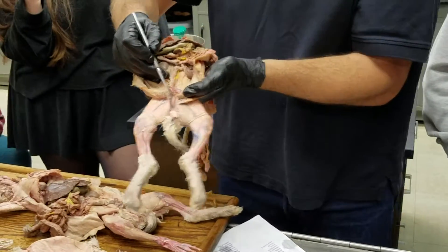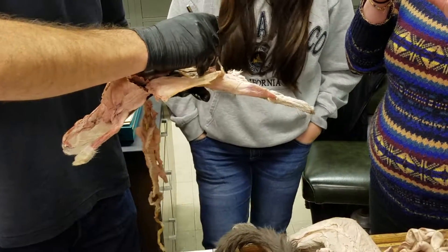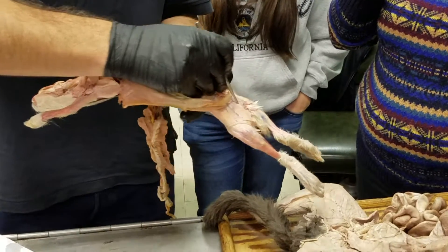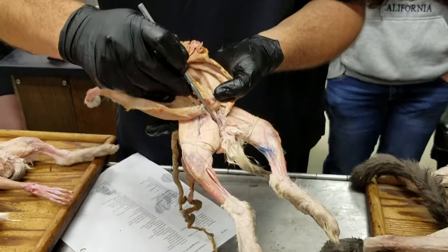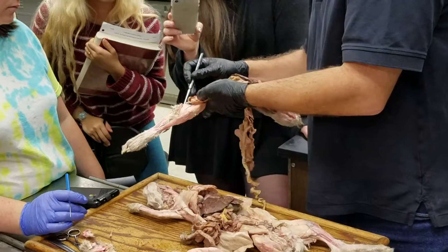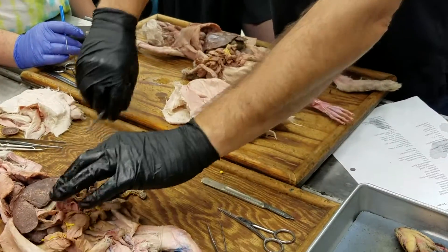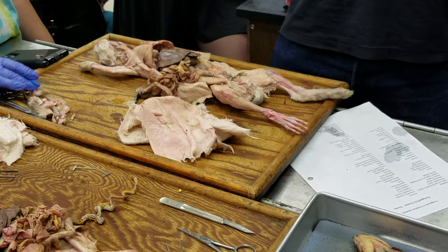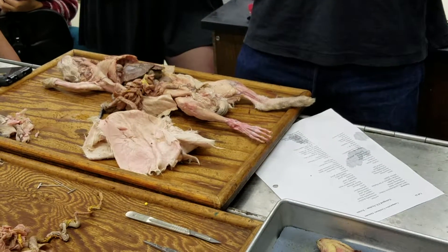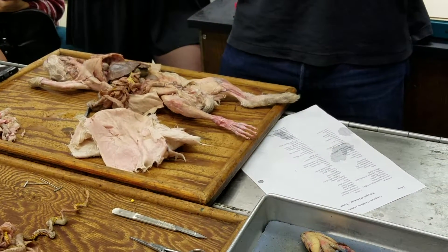The vaginal canal runs down behind the urethra coming out of the bladder. When the vaginal canal and urethra unite, they form a space called the vestibule or vaginal vestibule. In humans, the same arrangement exists — the vestibule is the space between the inner labia minora, and the urethra and vagina both open into it, though it's a very shallow space rather than the deep pocket seen in a rabbit or cat.